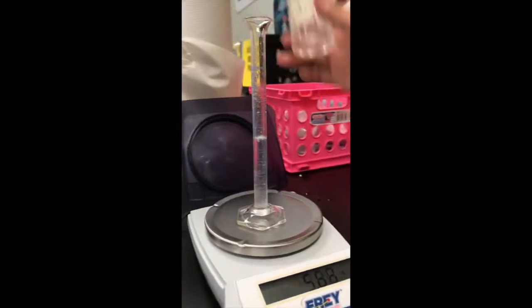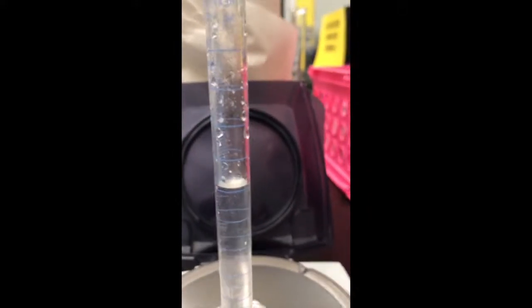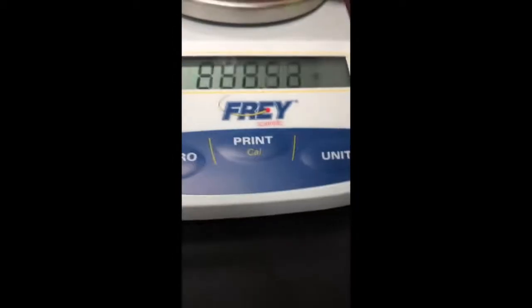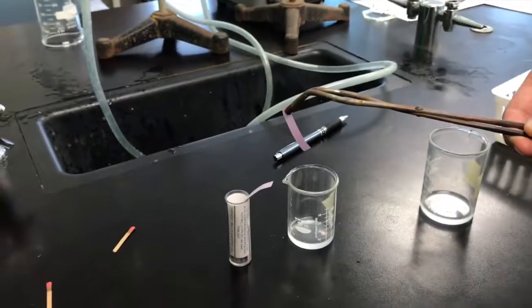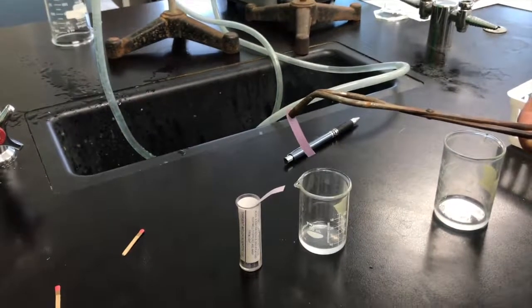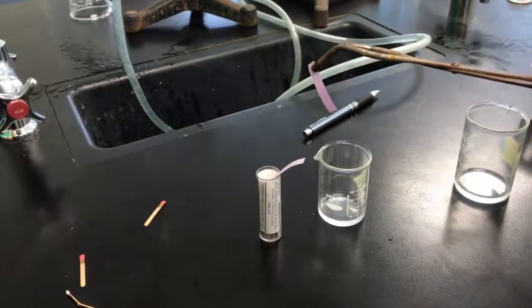To determine the density of each of the 3 substances, we poured the distillate into a graduated cylinder, measured the volume, and then measured the mass on a scale. We then found the density using the formula mass over volume. We used this process to determine the flammability of each of the 3 substances.